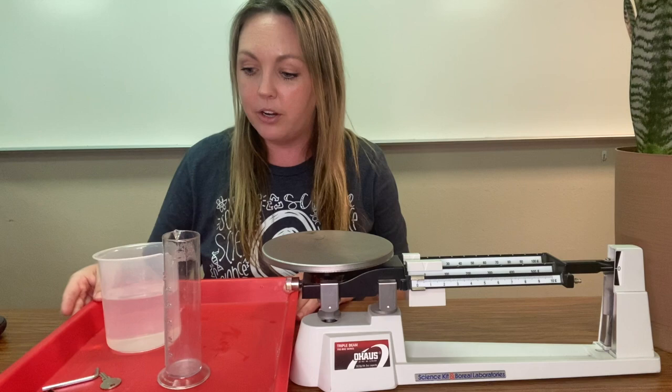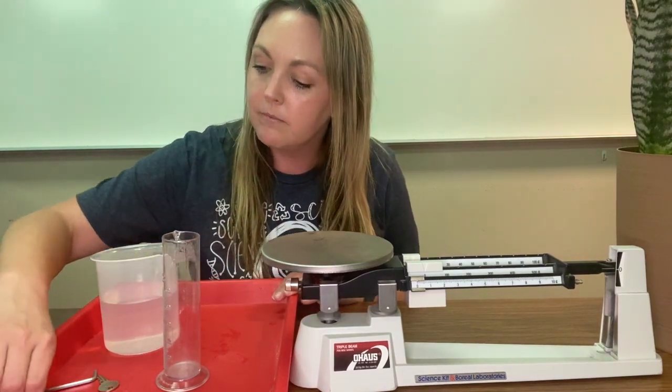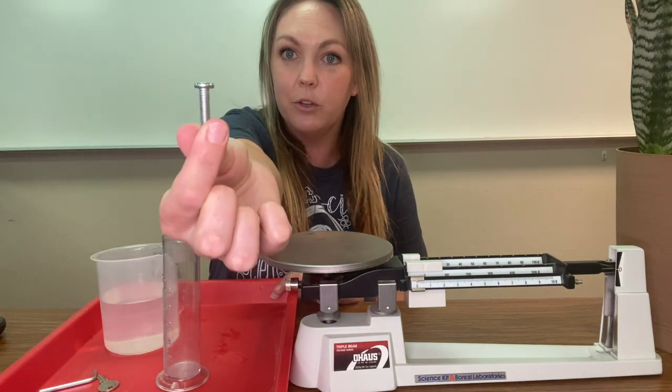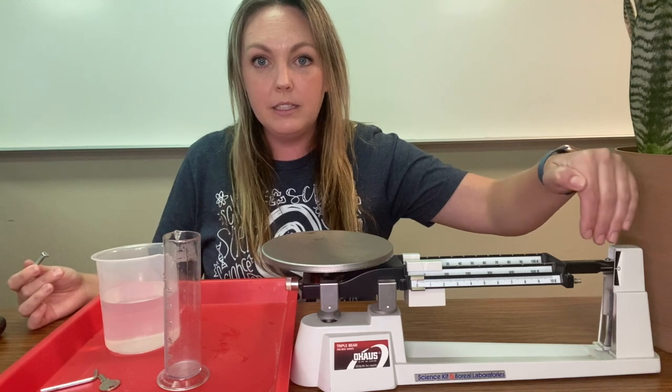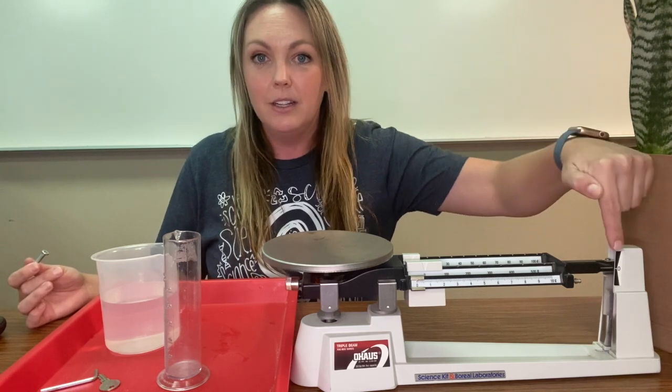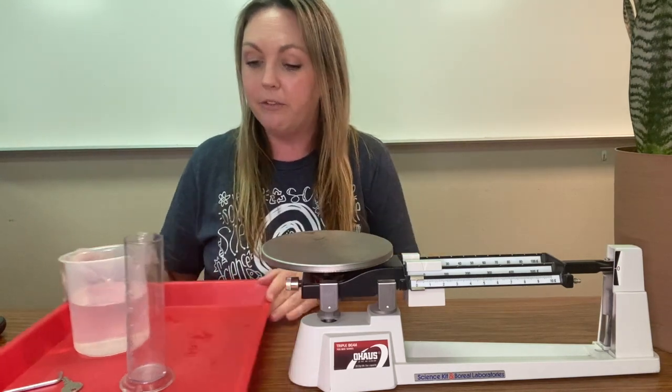So let's get started figuring out some mass and volume for some of these objects. First one is a screw. You want to make sure that your triple beam balance measures out at zero — this little line is going to match up with this little line. We're good, it's perfect.